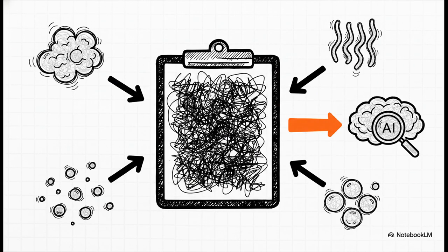But here's the crucial thing to remember. Your media alone doesn't tell the whole story. You've got a free-form notes section, and you absolutely need to use it. Typing out clear notes about the visible flock condition, any filaments you see, dispersed growth, foam, and the settling behavior gives the AI the critical context it's craving. If you spot filamentous bridging or notice slow settling, write it down. The AI is incredibly smart, for sure, but it can't read your mind, at least not yet. This extra text acts as a massively powerful guide.